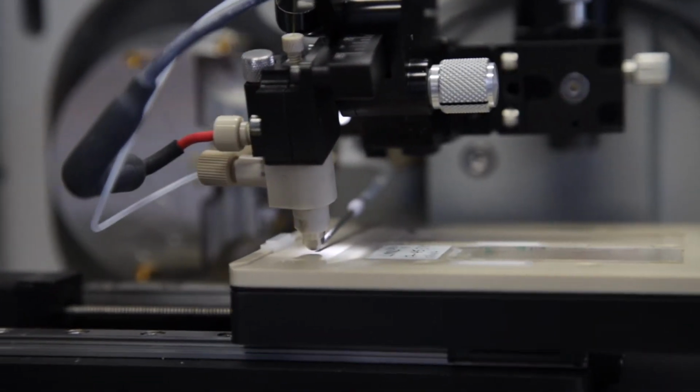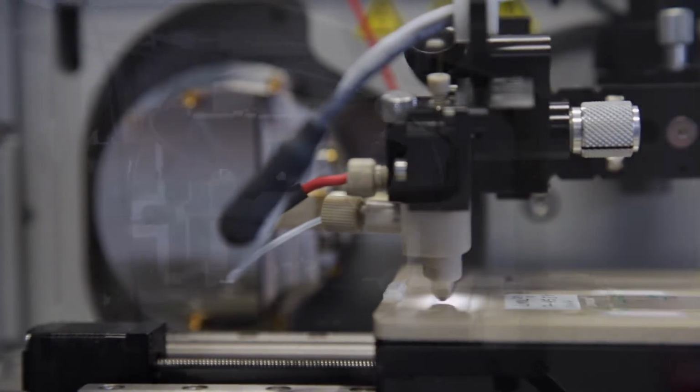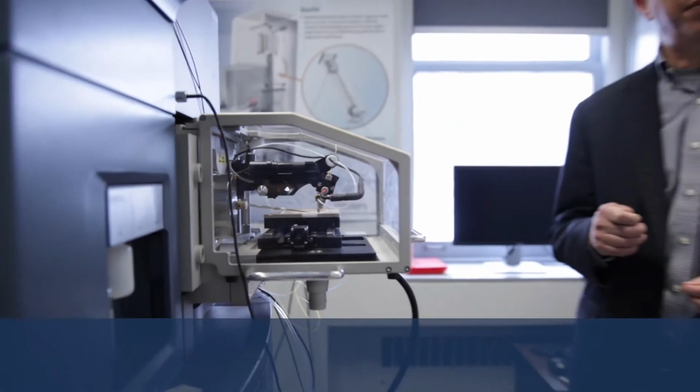But unlike typical imaging devices based on fluorescence or photography, DESI mass spectrometry is imaging the tissue based on molecular mass. It's able to determine when certain chemicals are high or low in different pieces of tissue.